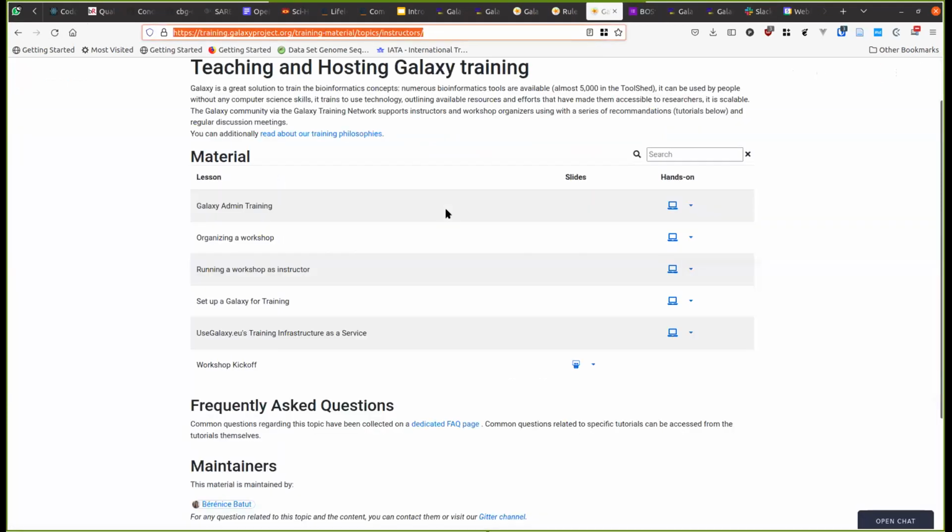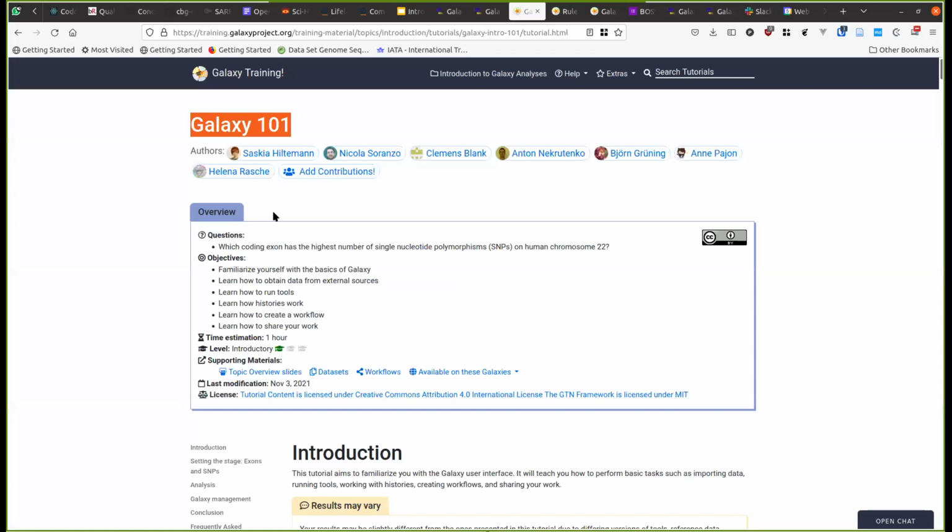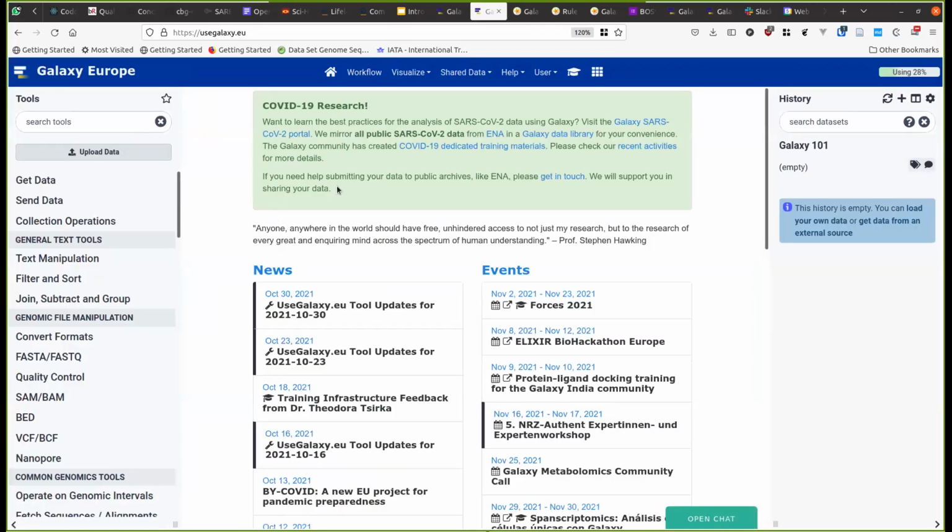I noticed quite a few of you are familiar with the Linux command line. That's great. I would like to point out that it is possible to work between the Linux command line and Galaxy. In other words, do some analysis on the command line and interact with the Galaxy server. There are training materials on that. There is an API in Python, and there are some command line tools, but perhaps that is a topic for an advanced session.